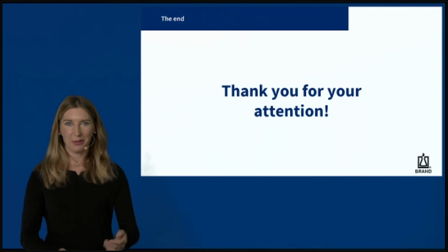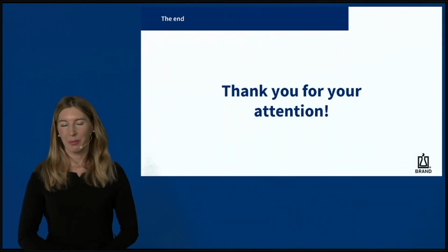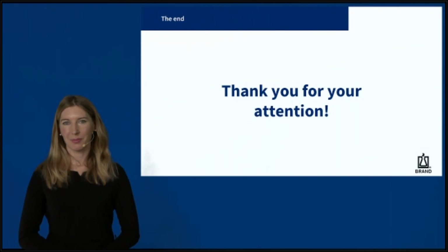Of course, as we already saw in the webinar, the best accuracy is achieved with a 1 microliter pipette, but also a 2.5 microliter pipette is totally okay. So you are within the limits of the ISO tolerance. So that would be great.